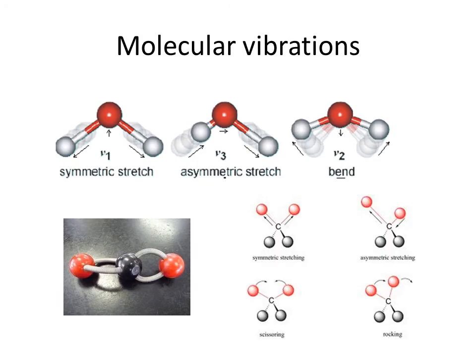And we also learned in that lecture that there's a conservation of energy, that energy is quantized, and that when energy interacts with molecules, molecules respond. As a result, if I shine infrared light on a molecule, the molecule will start to interact with that, and we can observe this process.